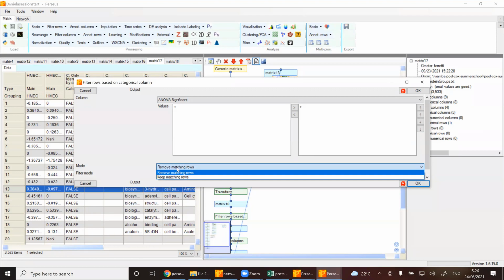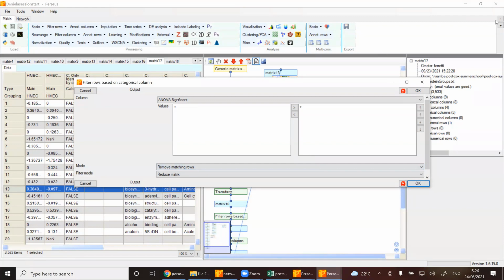Yes. Can you hear me? Yeah. Yes. So there are many questions related to median subtraction. So when do you do row subtraction and when do you do column subtraction? And why did you choose row subtraction here?